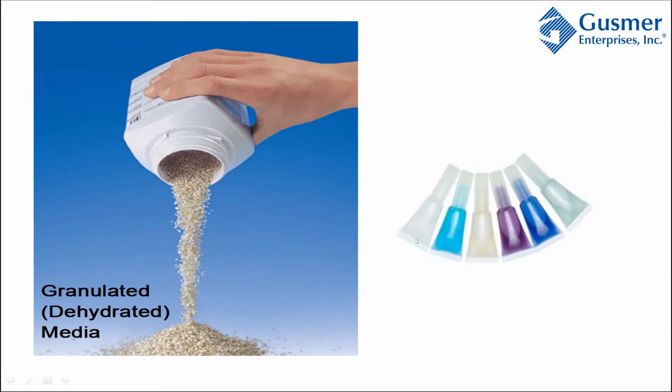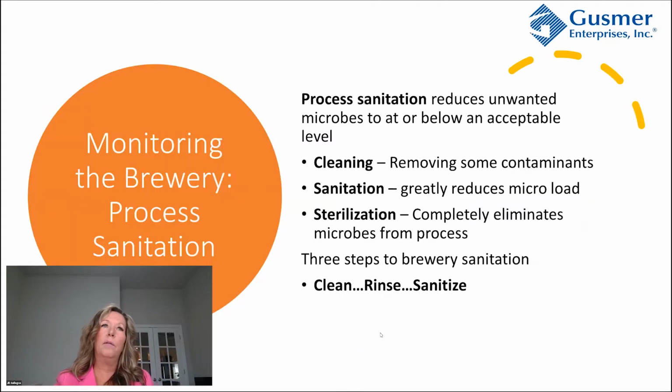So these are going to come ready-made, already sterilized, where you'll just add it to the Petri dish like that. So now let's talk about monitoring the brewery.